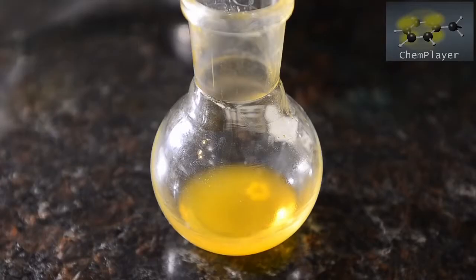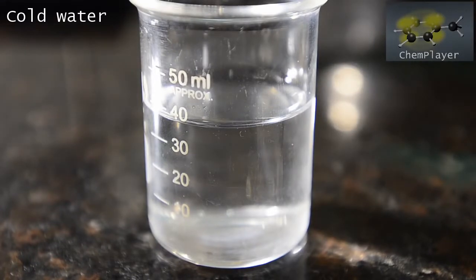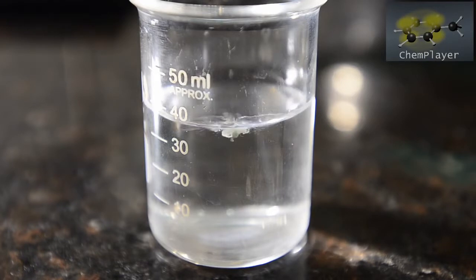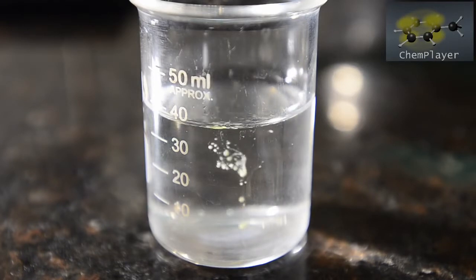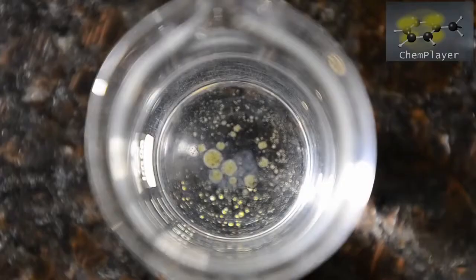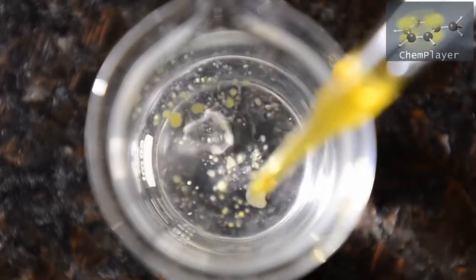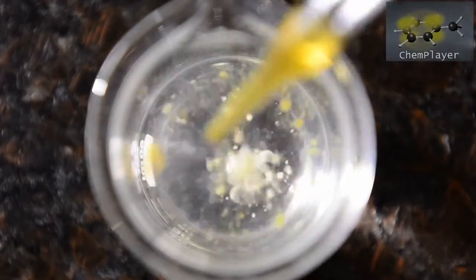Here's the last fraction of distillate boiling over at around 120 degrees C. It's too low boiling to be propionic anhydride, and too low to be propionic acid even. We placed some into water. The liquid sinks to the bottom in tiny droplets, but seems to react partially on the way. The resulting solution then fumes slightly in air.